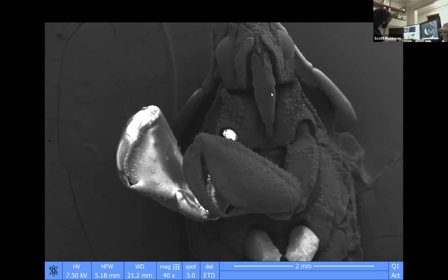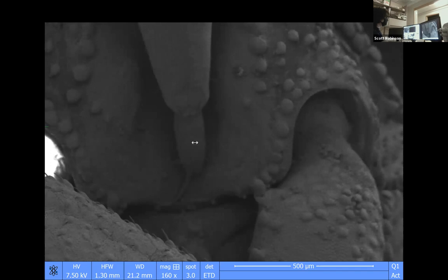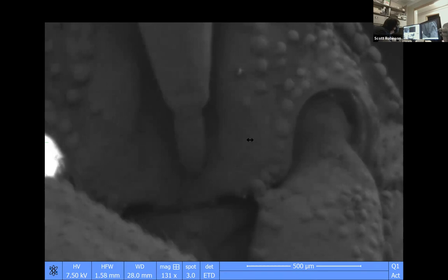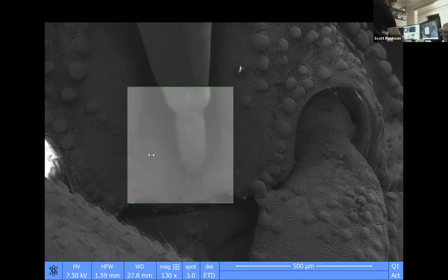If we can zoom in on this. Oh, no. There we go. All right. I think I'm getting zoomed. Okay. Maybe I'm going back. So, to make it so that you can see better, go ahead and put a small screen there, and now you have the ability to focus left and right. Awesome. Does that speed up how fast it adjusts? It gives you a thing to focus on so that you can just pay attention to that one particular thing.